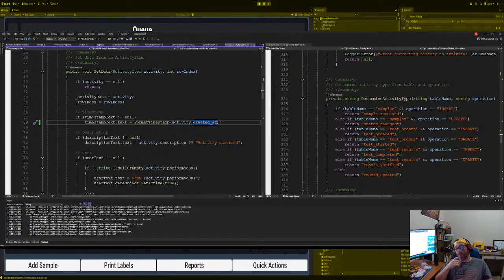We could also use some dictionary assets, so we could make the footprint smaller, and that way it fits on the website. Okay, does that make sense? We're good. Yes. Okay. So let's finish with the queue.